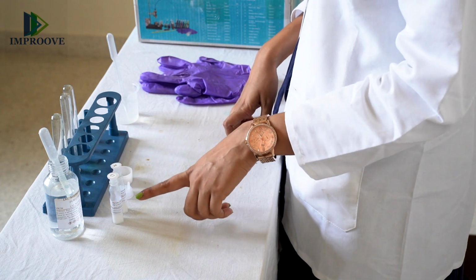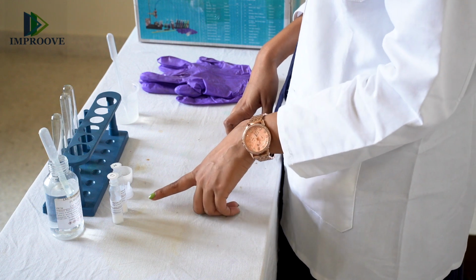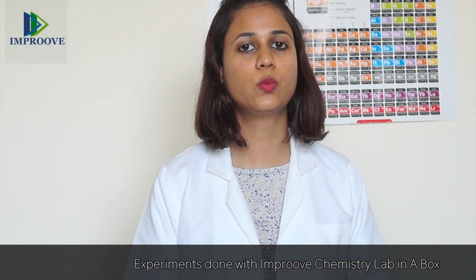and salts of barium chloride and sodium sulphate. So when a solution of sodium sulphate is mixed with barium chloride solution, the ions of sulphate displace the chloride ions in barium chloride solution, and similarly the chloride ions displace sulphate ions in sodium sulphate solution. So that is how a double displacement reaction takes place, thus giving rise to a white precipitate of barium sulphate.